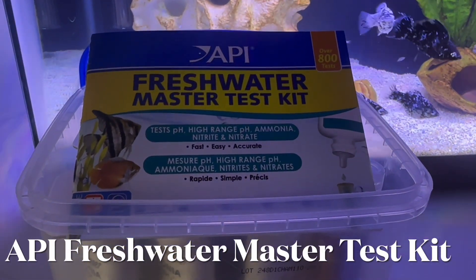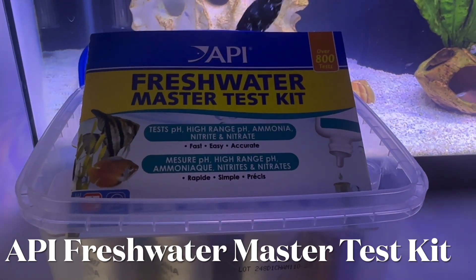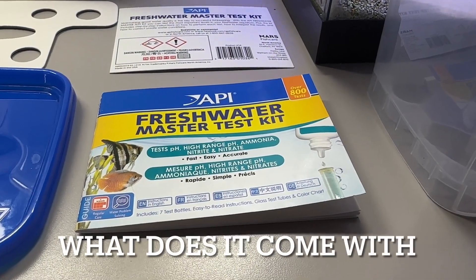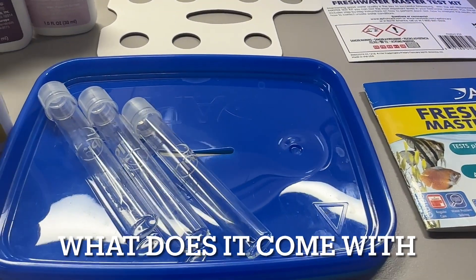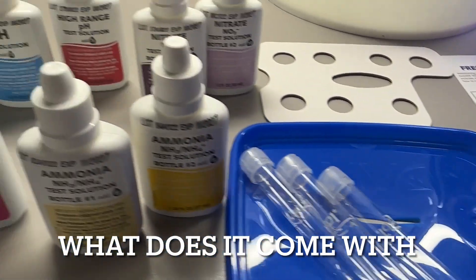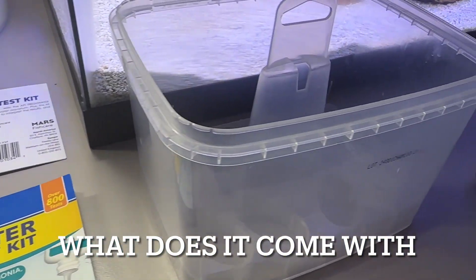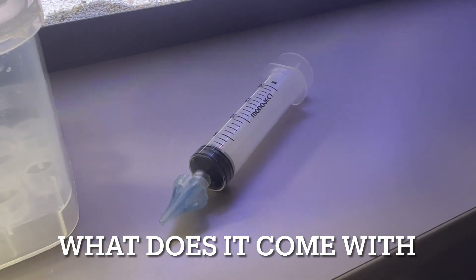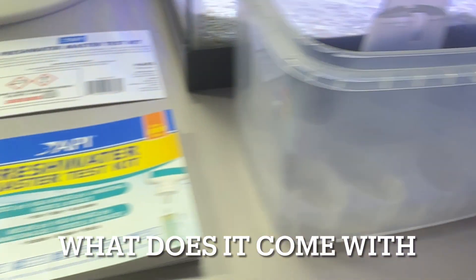This is a tutorial for the API Freshwater Master Test Kit — how to do it, everything you need to know. The kit comes with instructions, the lid, the vials, a little extra paperwork, and the test kit solutions. It does not come with an eyedropper, and I highly recommend getting one to make filling your test kit solutions much easier.